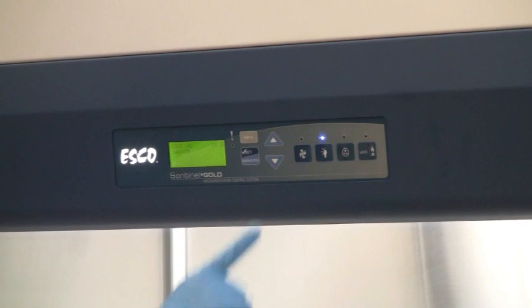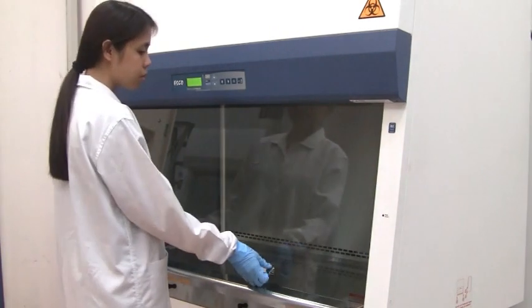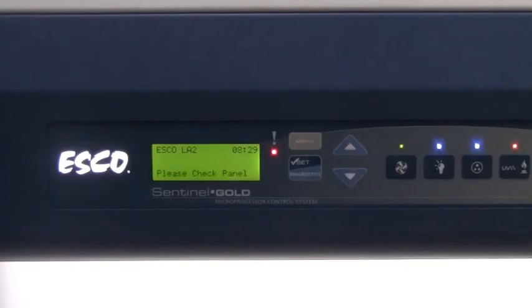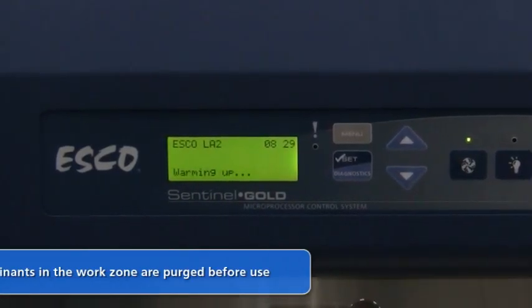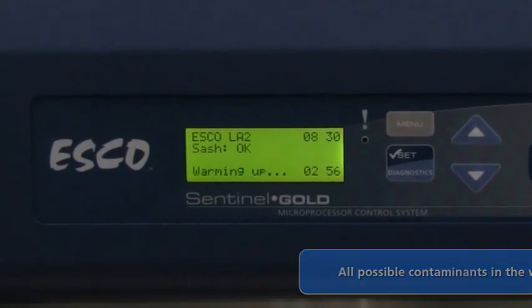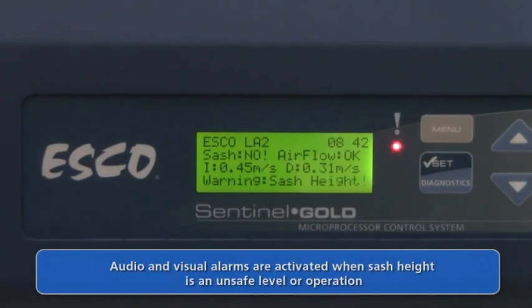The LabCulture Class II Type A2 Biosafety Cabinet can be started by pressing the fan button, or when quick start mode is chosen, by simply opening the sash to the operating height. The Sentinel Gold microprocessor control has a default warm-up cycle of 3 minutes, during which time the cabinet work zone is purged of all possible contaminants. Audible and visual alarms alert the user to unsafe conditions, such as when the sliding sash is at an unsafe opening height which may cause airflow disturbances.